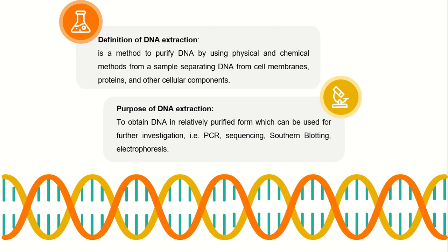DNA extraction is a method to purify DNA by using physical and chemical methods from a sample, separating the DNA from cell membranes, proteins, and other cellular components. The purpose of DNA extraction is to obtain DNA in relatively purified form, which can be used for further investigation, for example PCR (polymerase chain reaction), sequencing, Southern blotting, and electrophoresis.